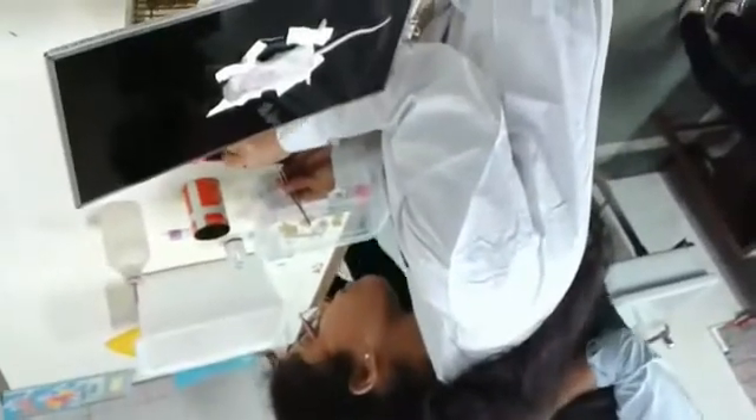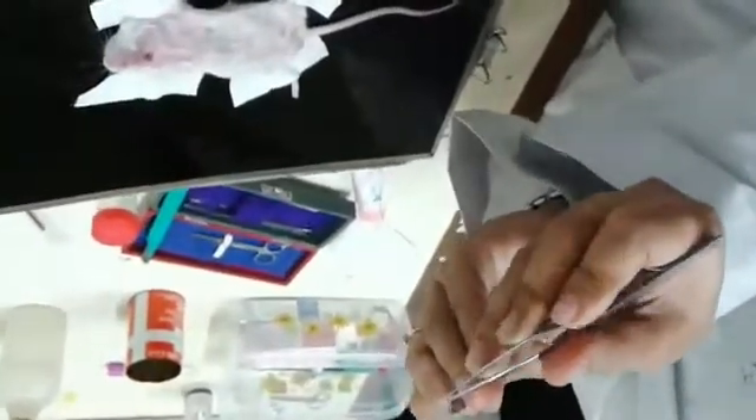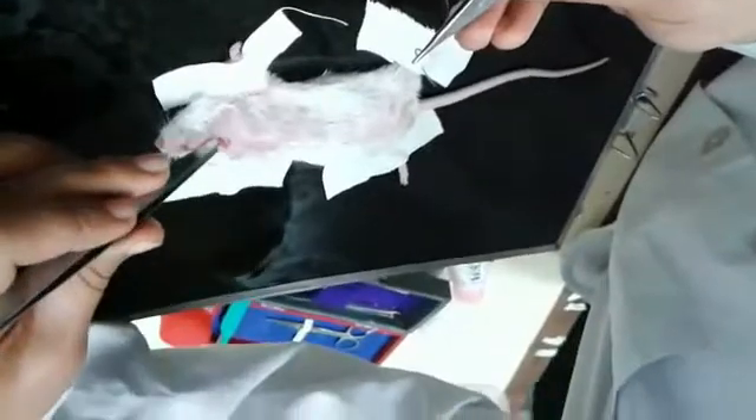After injection, stitch the wound of the animal model with the help of suture, so that it decreases the chances of infection in the wound region.